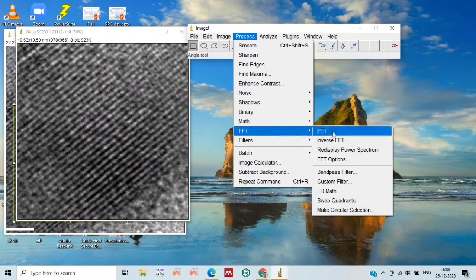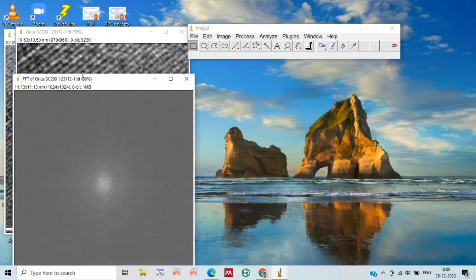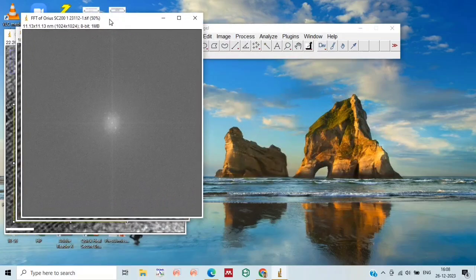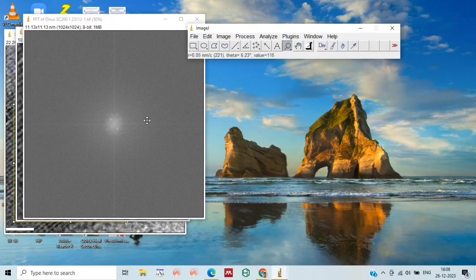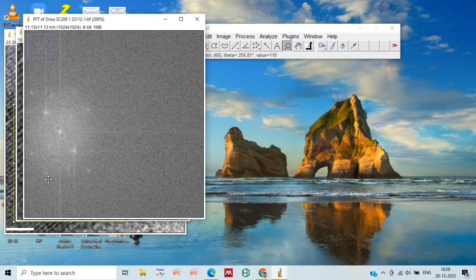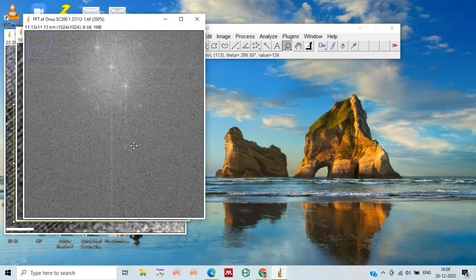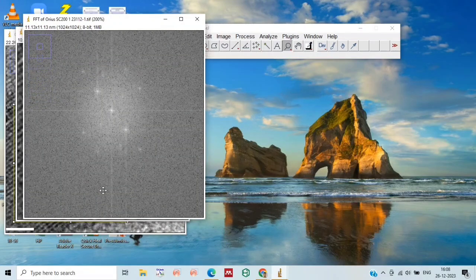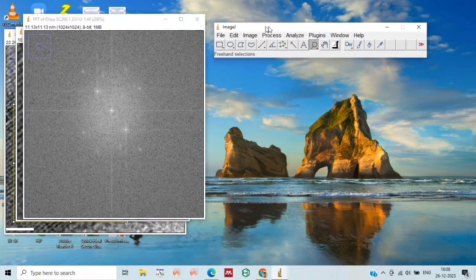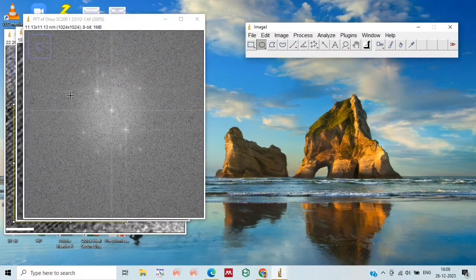Next, what we need to do is FFT, where we will get this diffraction pattern. Just select the oval tool and drag it over this point.